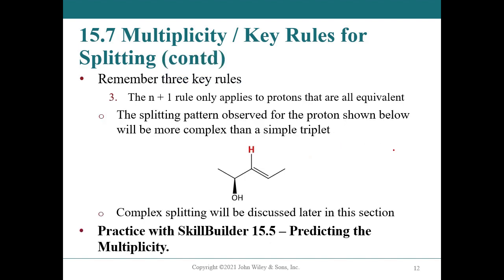This does apply, it says here, I'm going to change this, the n+1 rule only applies to protons that are all equivalent. I'm going to strike that equivalent and put that have same coupling constant.